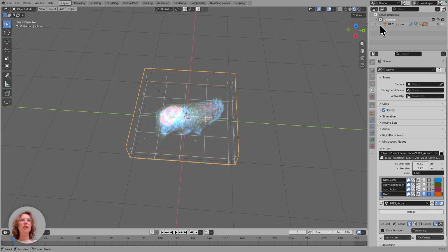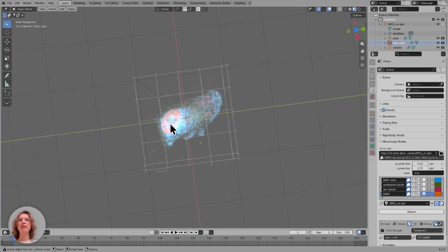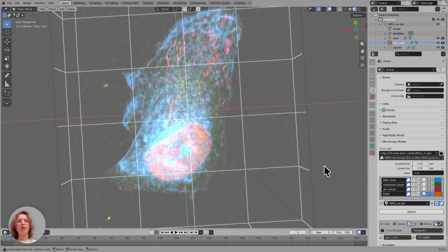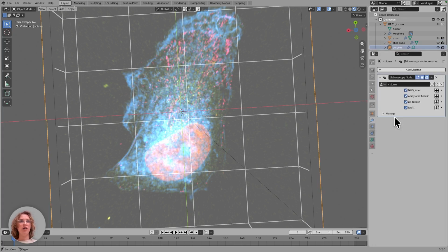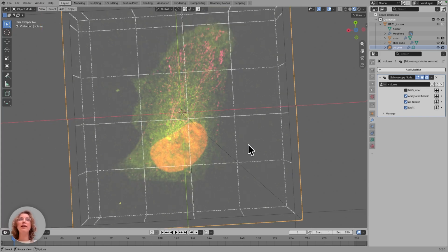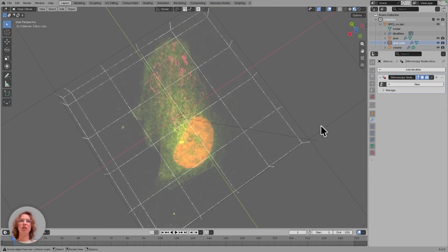Our slice cube will create a mask of which voxels are being visualized. If we then select a small region that we're interested in, so for this data set, for example, I know that somewhere in here there are actually the centrioles, and they are slightly hard to see, they're here, but with this low resolution we don't really get the complete picture of how the centrioles look in this expansion microscopy data set.